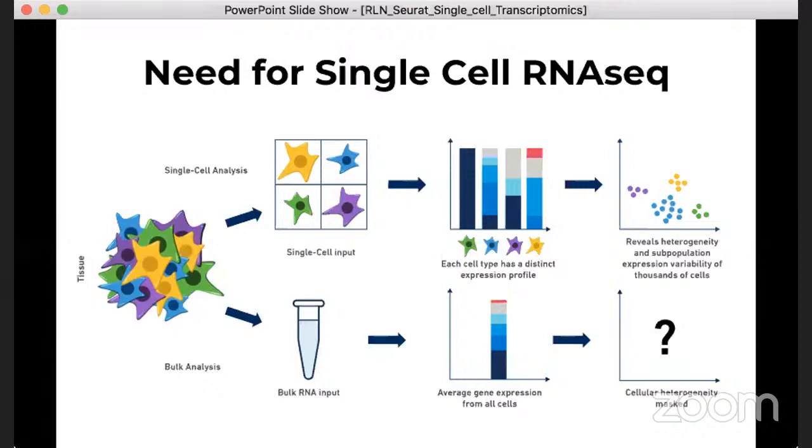So we already found out that single cell transcriptomics quantifies mRNAs present in each and every single cell, and this is widely used in single cell profiling techniques that help us identify different cell types present in our sample, and also understand the heterogeneity and different categories, subcategories or populations of cells present in the sample, by analyzing the expression variation between these cells.